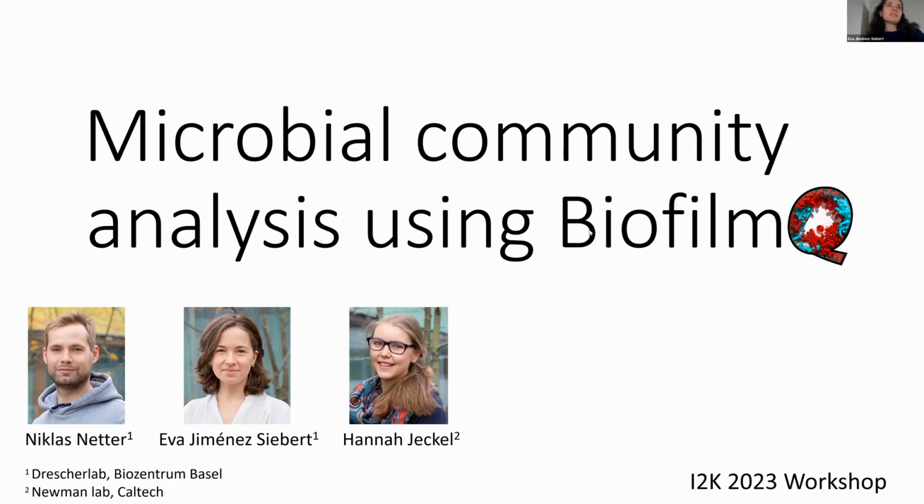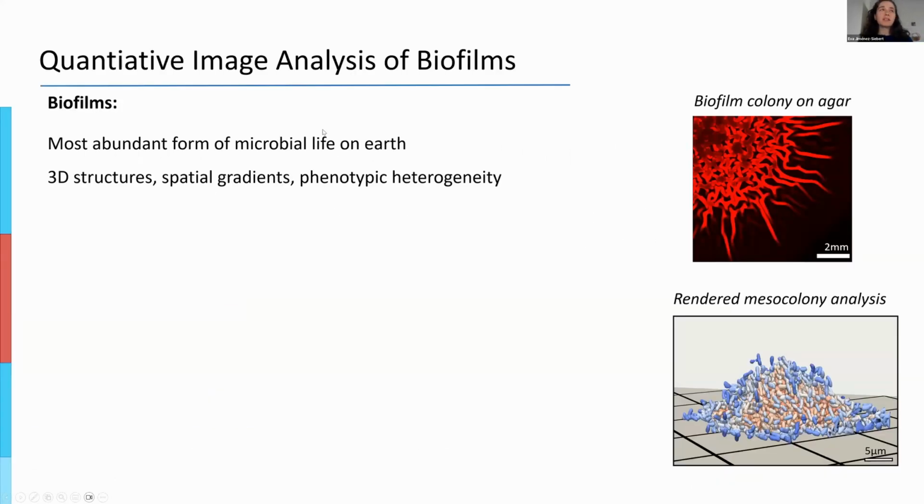So yeah, to get started, I need to activate my presentation. Okay.